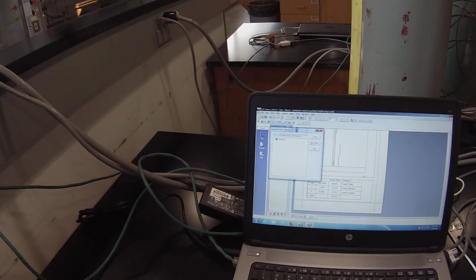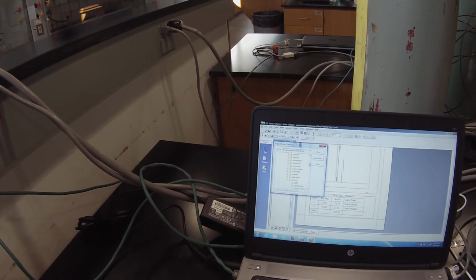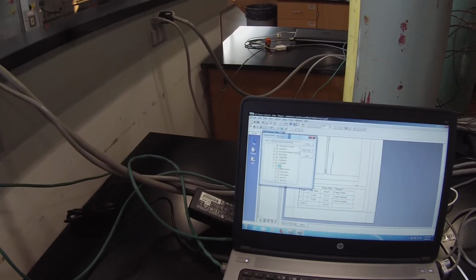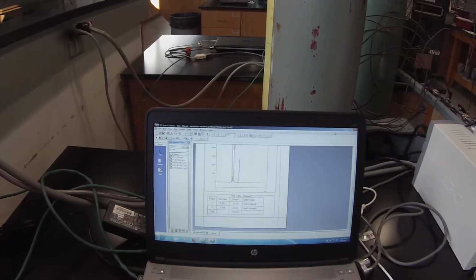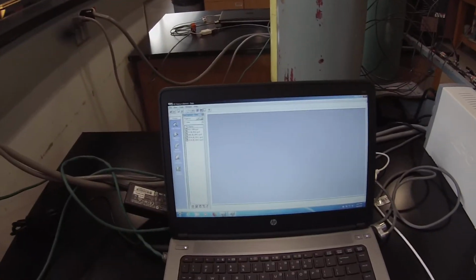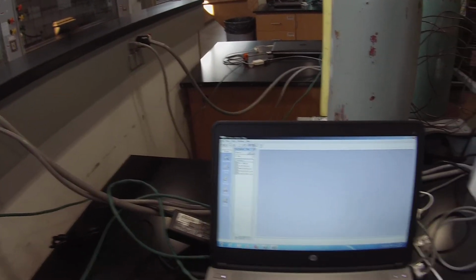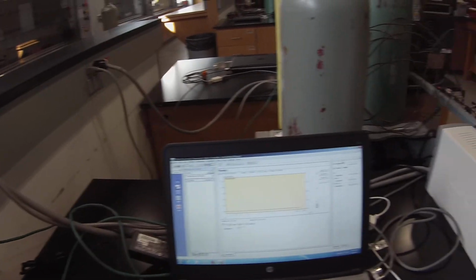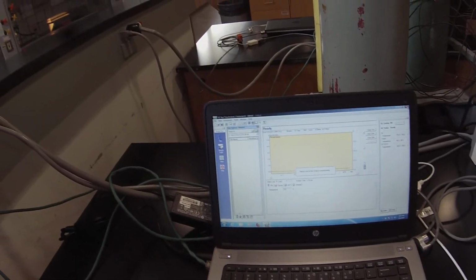So I can point the folder back, so it's pointing at just JData. Close the report format file, close the data file, and I can close that program. I don't need that anymore, and I don't actually need the real time, so I can close that.